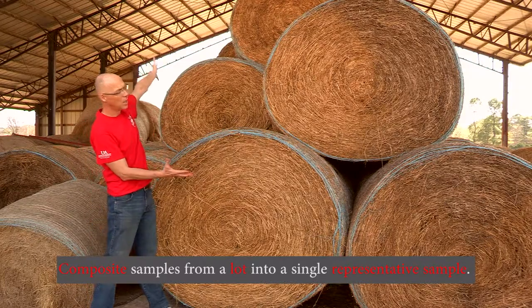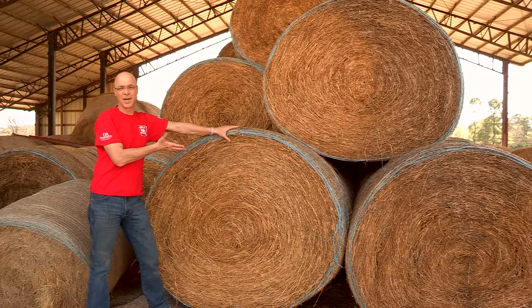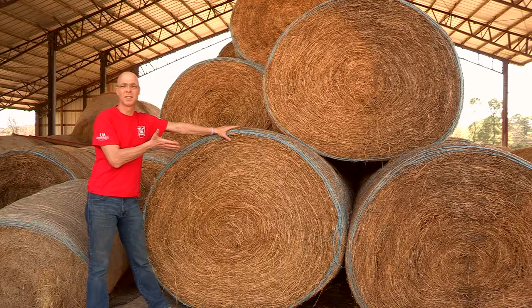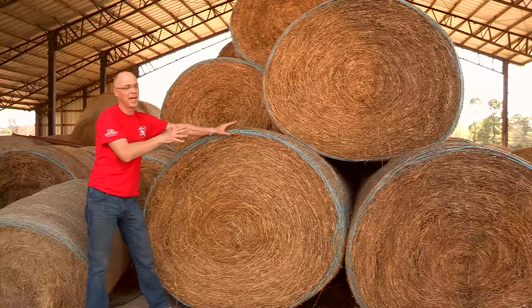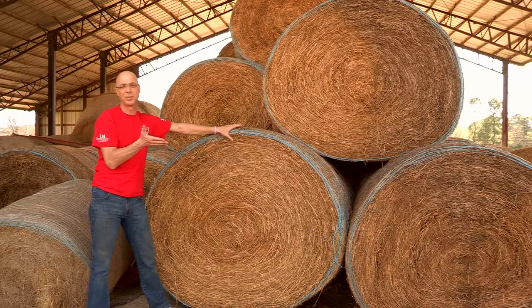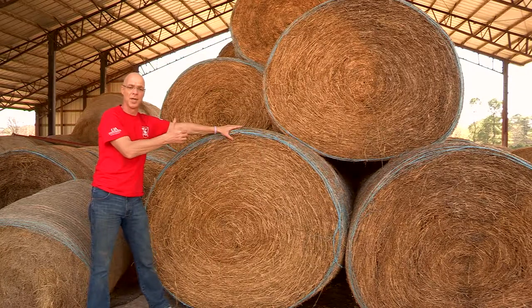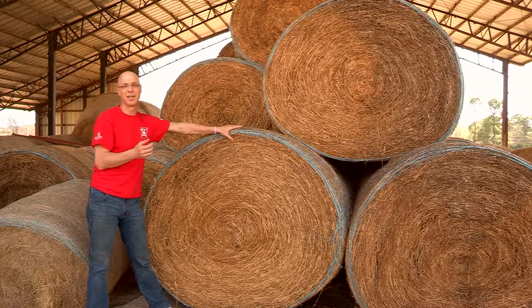In our example, we may have 20 to 30 bales in the barn, and you want to take samples from at least five bales randomly, or wherever you can access them. Sample each of those selected bales and composite them all into a single bag, then ship it to the laboratory.